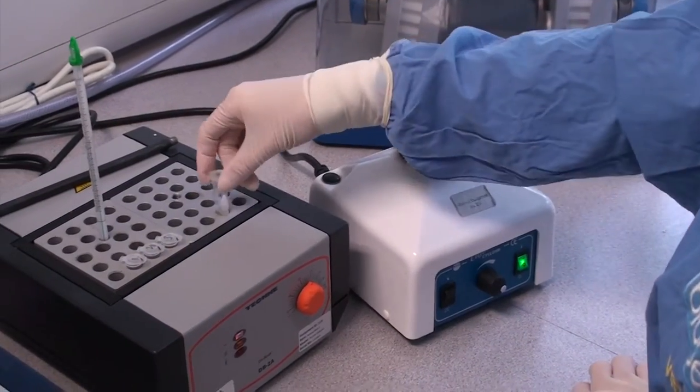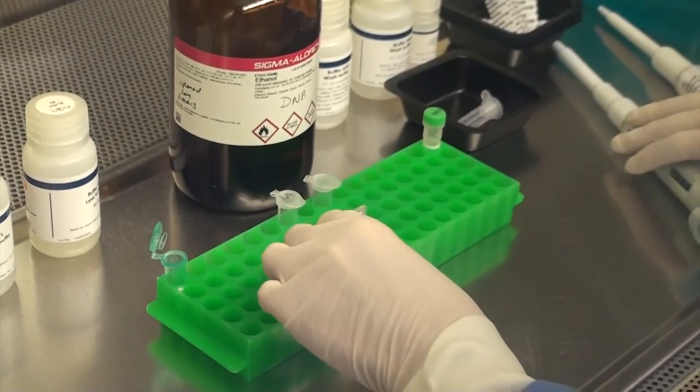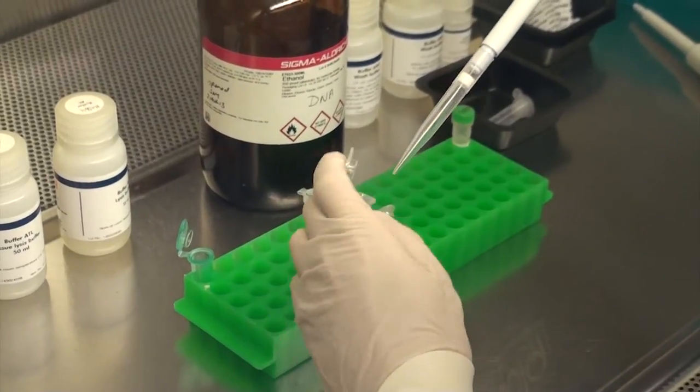The resulting DNA extract is subjected to a special process called polymerase chain reaction, or PCR. This process takes the DNA and multiplies it many times while looking for the specific regions that tell us whether a sample is male or female.